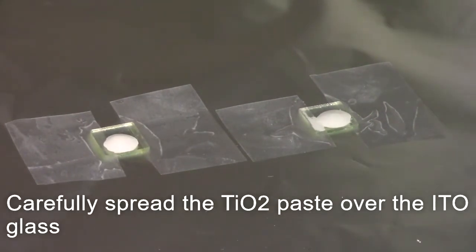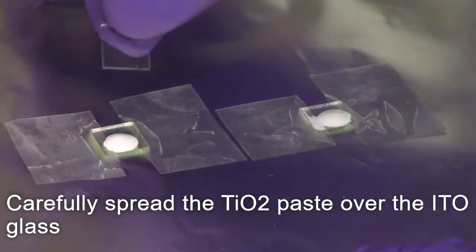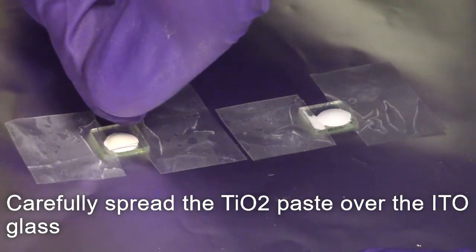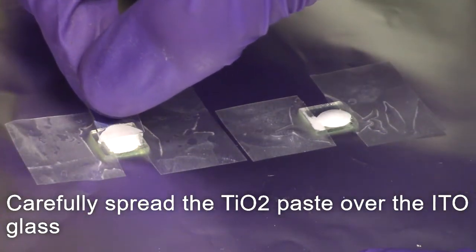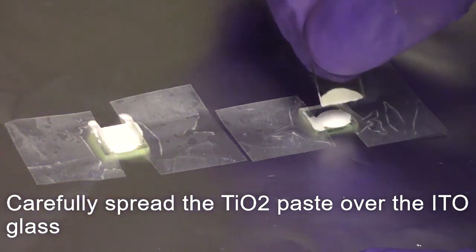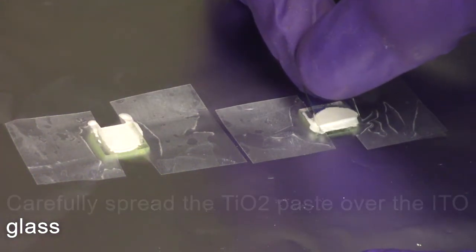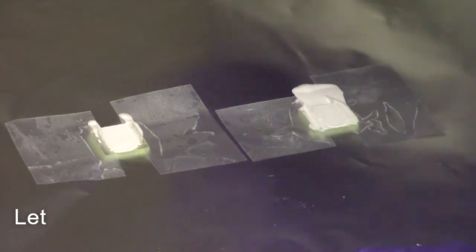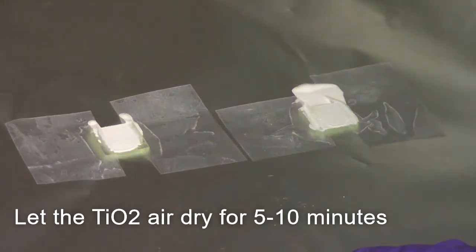Carefully, with a straight edge, spread the TiO2 paste over the ITO conductive side area. Now allow to air dry for 5 to 10 minutes.